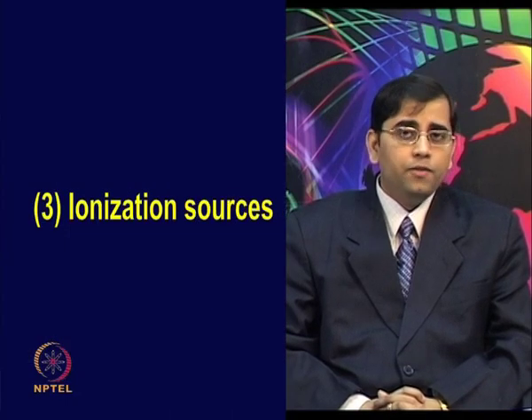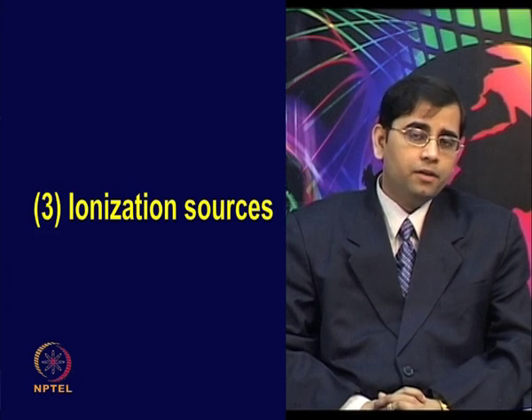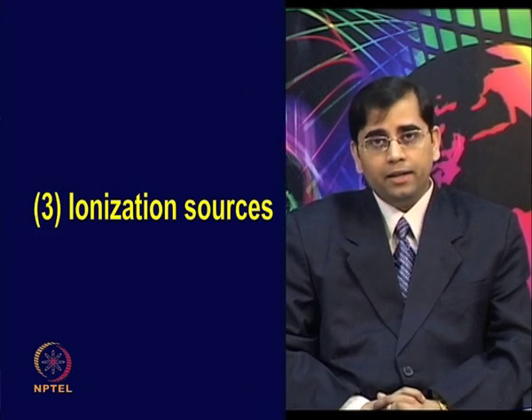So far we have talked about trypsinization or doing the peptide cleavage. Then we talked about pre-fractionation strategies, liquid chromatography. Now, these samples are ready to be injected into the ionization sources.